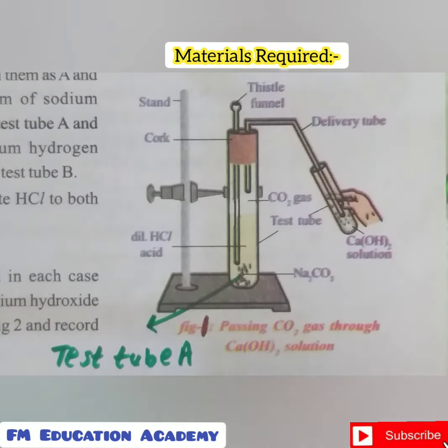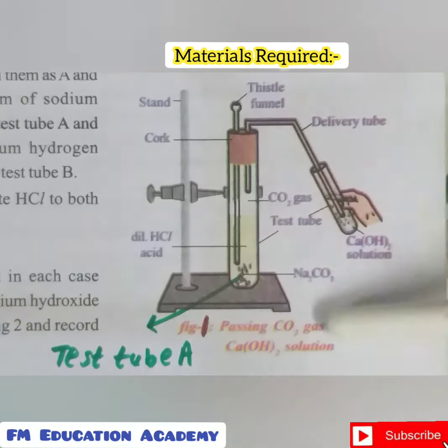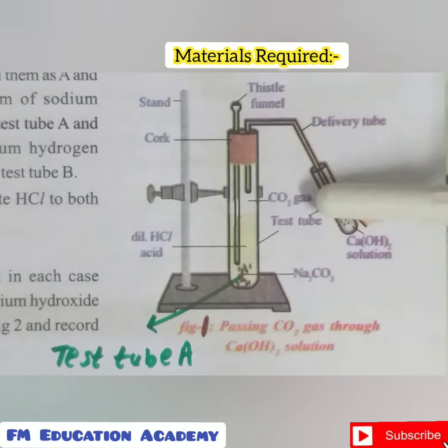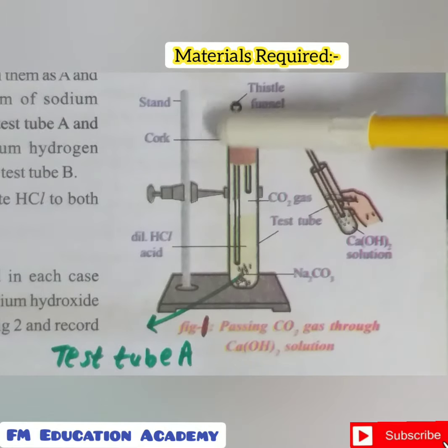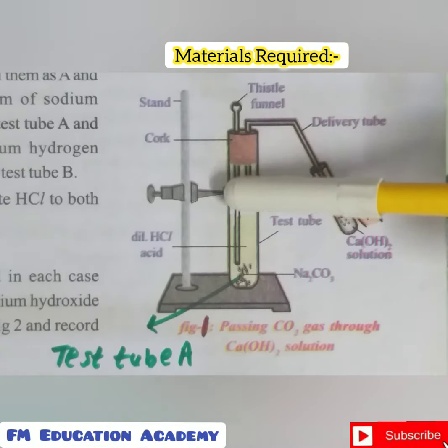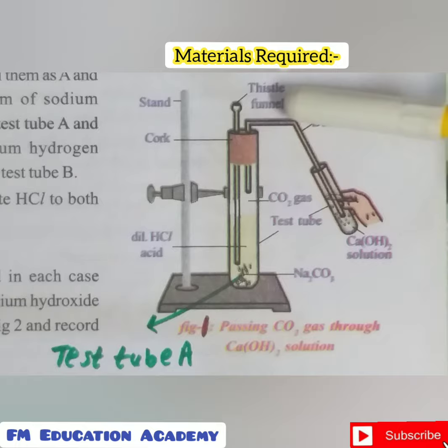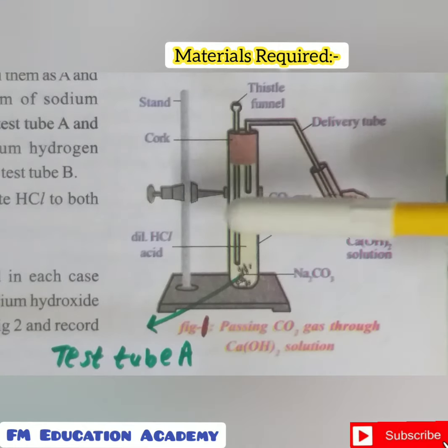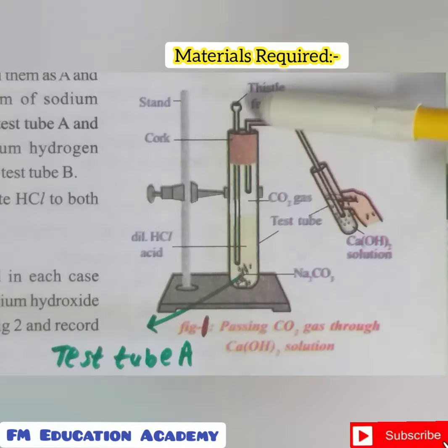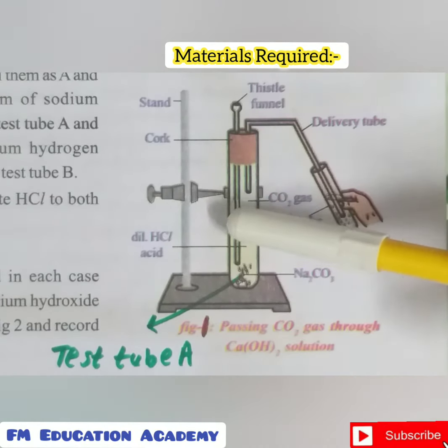These are the materials required. We need a stand, which has a holder, and we need two test tubes. This is one test tube which has a cork fitted to it, and that cork has two holes. In one hole a thistle funnel is fixed, and in the other hole a delivery tube is passing through to another test tube. So we need two test tubes, a thistle funnel, a delivery tube, a stand, and in the test tube we need dilute hydrochloric acid.